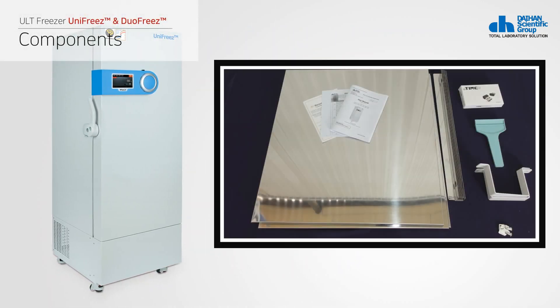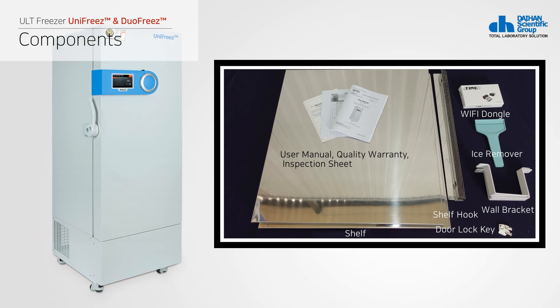The ULT Freezer is composed of the product main body, user manual, quality warranty, inspection sheet, shelf and shelf hook, wireless LAN card, ace remover, wall bracket, and door lock key.